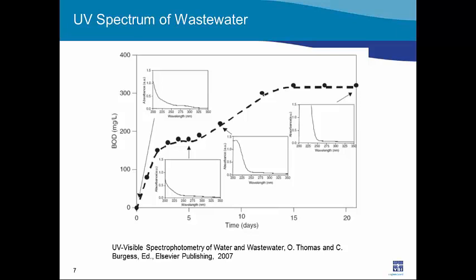If we were to set up our BOD test and took samples at regular intervals, measured the DO and also the absorption spectrum for each of those samples, we'd find that at day 0, when we started the test, we'd have a curve shaped like so on the top left. It would have relatively high absorbance, reflecting the absorbance from all the organic chemicals in the water.